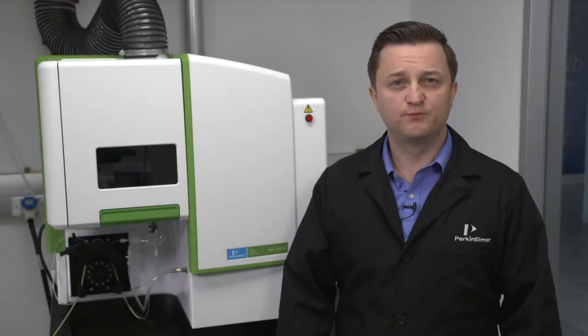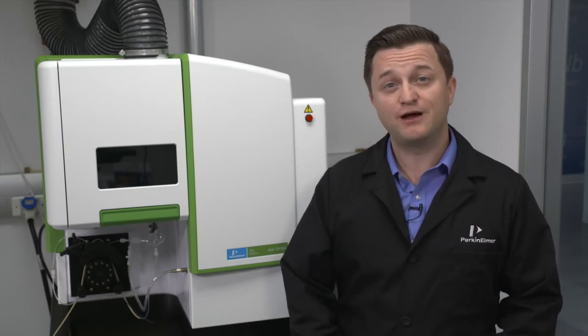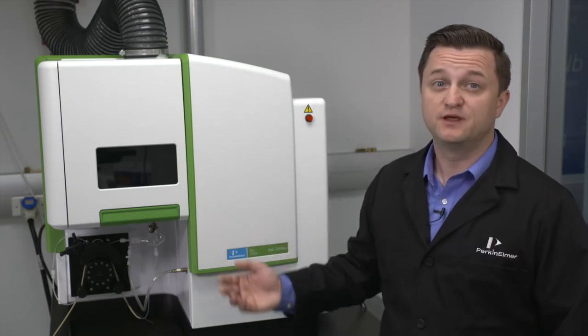Hi, welcome to a brief PerkinElmer video on maintaining your high performance Ovio ICP OES system. I'm Aaron Heineman and in this video I will demonstrate how to remove the torch module for your Ovio ICP. This torch design is carried throughout the Ovio series, including the Ovio 220 MAX system that we have here.